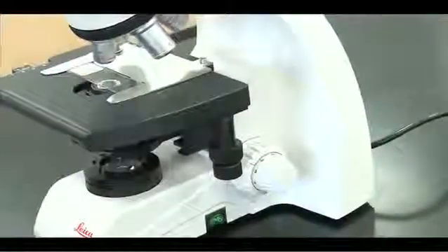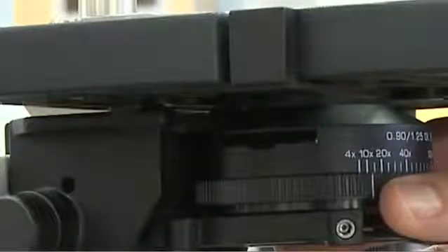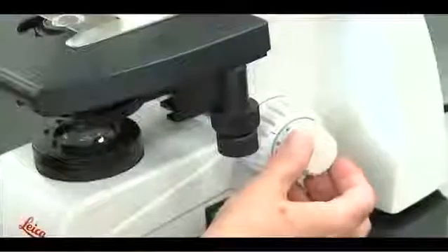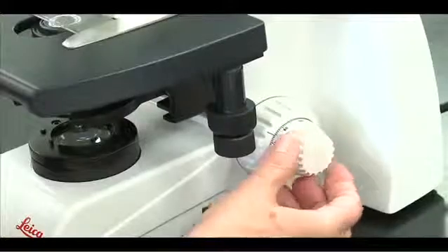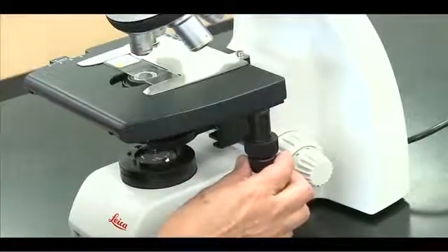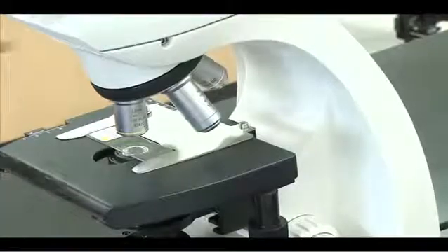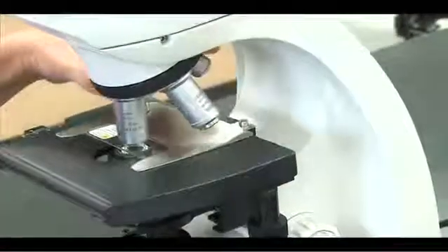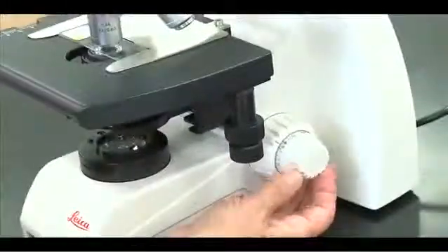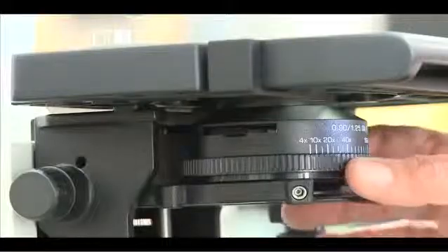Rotate the 10x objective into position and set the iris diaphragm ring to 10x. Focus with the fine adjustment knob only and scan your slide. Repeat these steps when you rotate to the higher powered objectives, matching the diaphragm ring setting to the objective magnification.